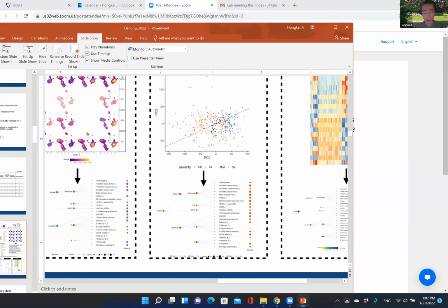Indeed, in one of our immunotherapy studies, we only have 10 to 20 patients. We can still do this analysis, and the consequence we can see is some separation between different patient categories, but the statistical test p-value may not be significant. Say you got a p-value of 0.1 or 0.2, right? Which does not pass your significance threshold because you don't have enough power.